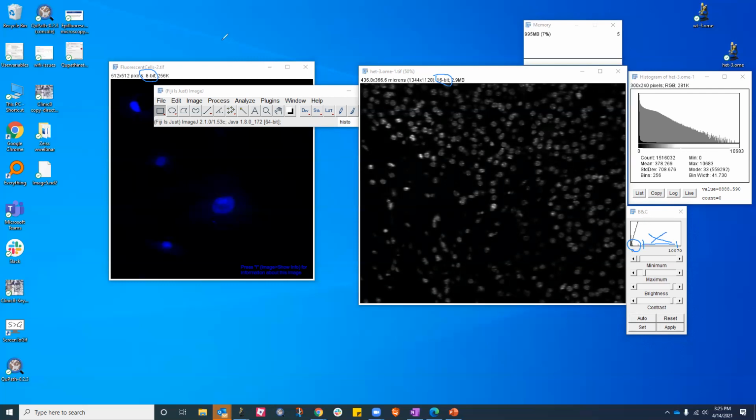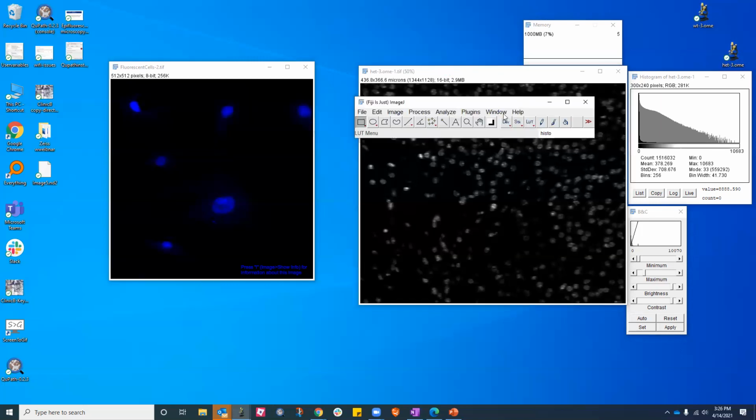All right. So let me clear all of this. And one of the ways to look at the value of each of the pixels is by hovering your cursor onto the pixel, right? And this is where the good lesson comes into the picture, which is the scale always goes from black to white. Okay, so blacks will be 0, whites will have increasing values associated with them.